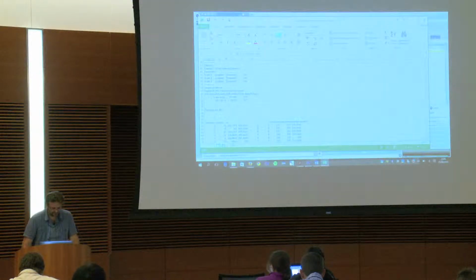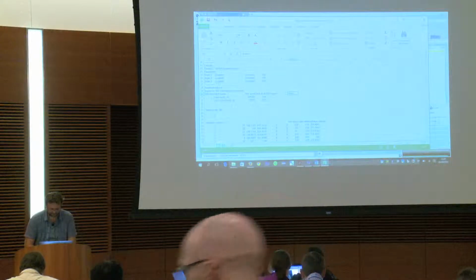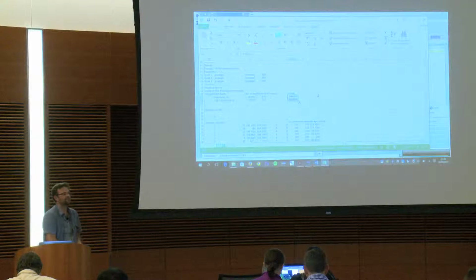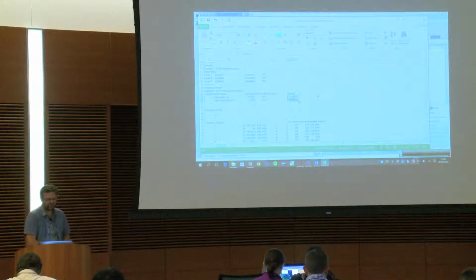And here I see all the information about my experiment. And if I want to see the density, because it was my first question, I type density here. I'd say that's equal to this over this. And now I have my density for the two, and I can say, okay, there is something significant.